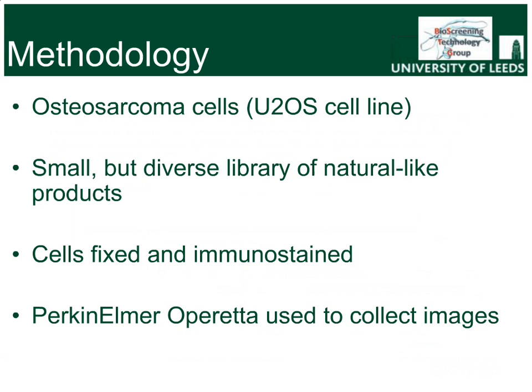This assay was developed using an osteosarcoma cell line, U2OS cells, that are very amenable to high-content screening as they form flat, evenly spread monolayers. Other cell lines could be used with this assay. For example, HepG2 cells used by O'Brien and Pearson, or other cell lines appropriate to the primary screening endpoint, e.g. a neuronal cell line if exploring Alzheimer's therapeutics.